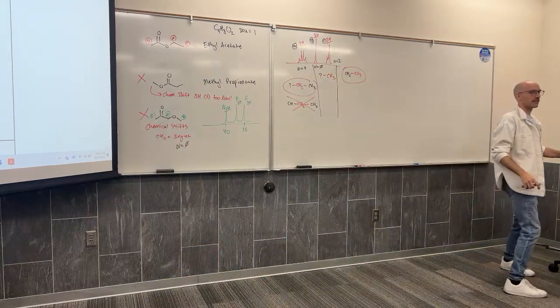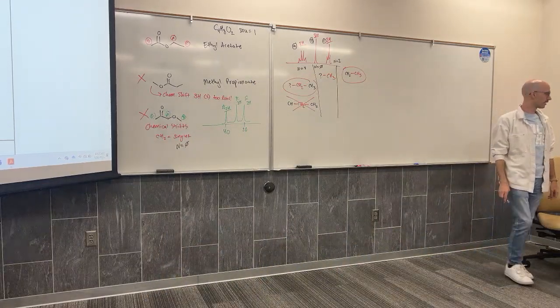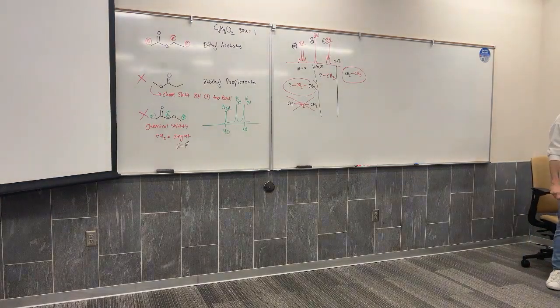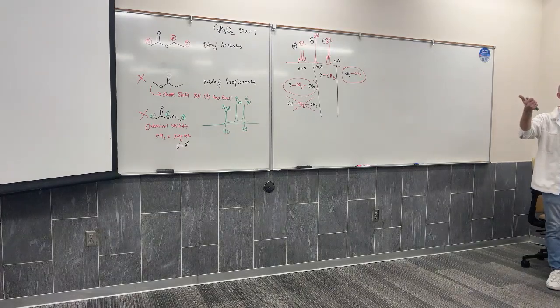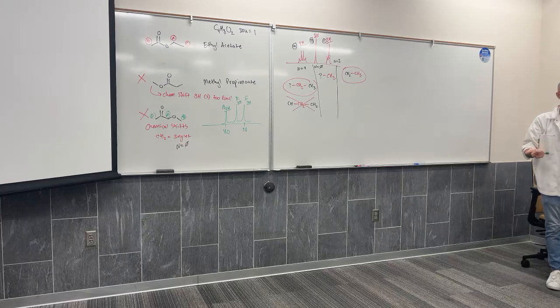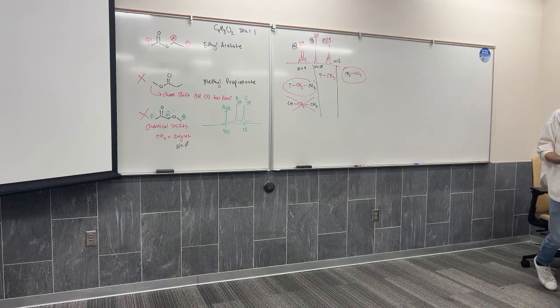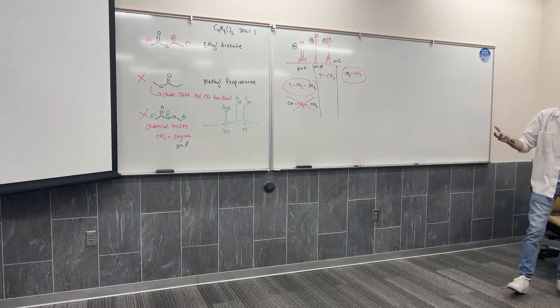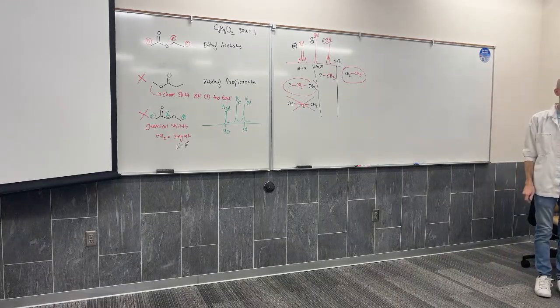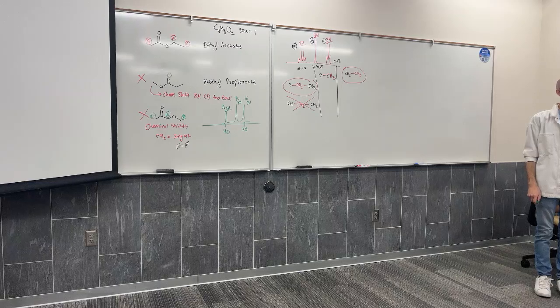All right, what do you guys think? Was that an interesting analysis of IR and NMR to deduce a chemical structure? We did it. We solved it. IR helped us narrow down all of the structural isomer possibilities. Well, first, degrees of unsaturation helped us narrow down what we could expect. Then, IR helped us narrow down structural isomer possibilities, helped us figure out what bonds must be present, what bonds cannot be present. NMR helped us confirm splitting patterns, chemical shifts, integrations.